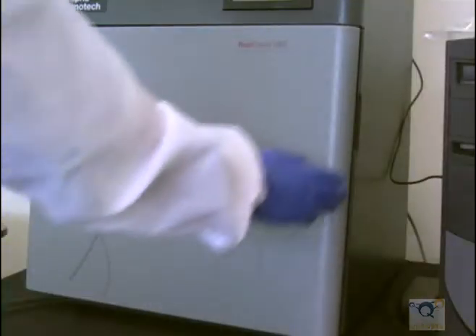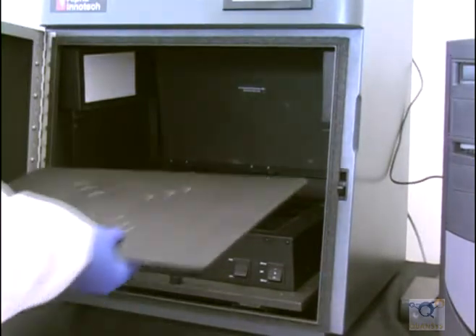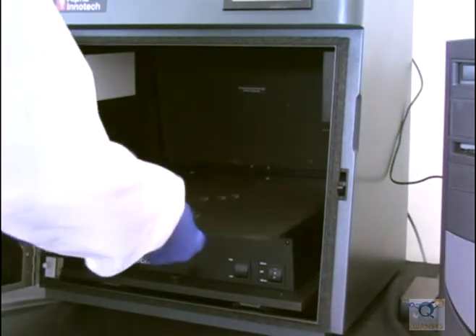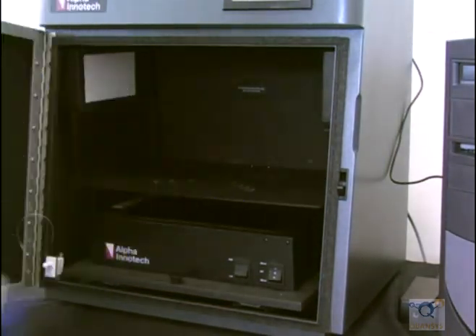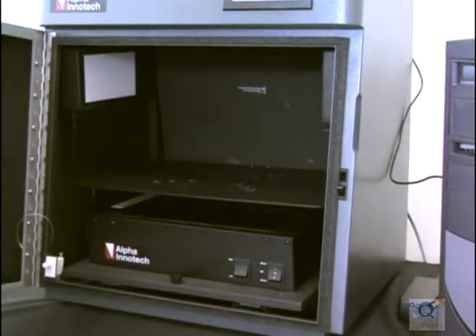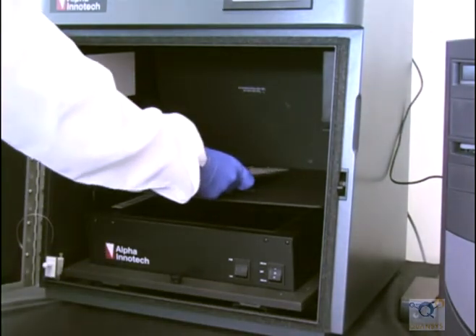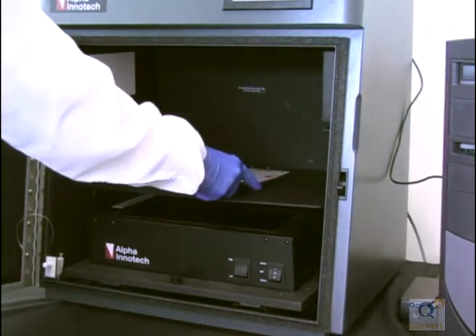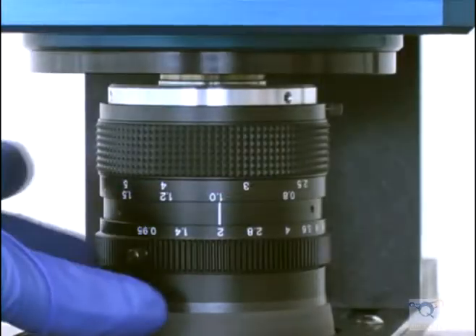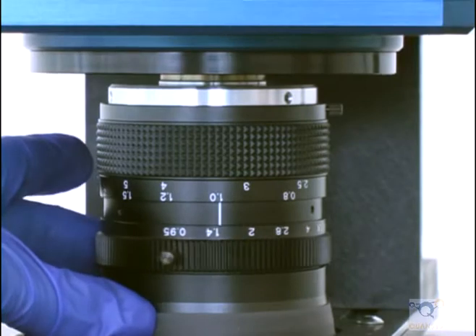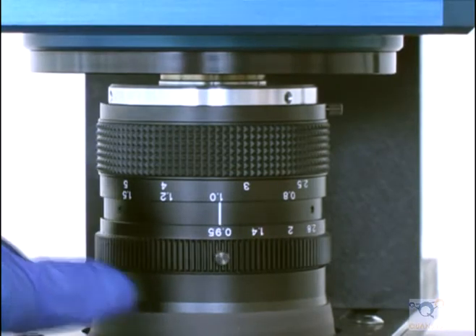Open the camera door and set the adjustable tray on the lowest level. Then place the mouse pad in the center of the tray for focusing. Open the aperture on the camera all the way to the lowest value.